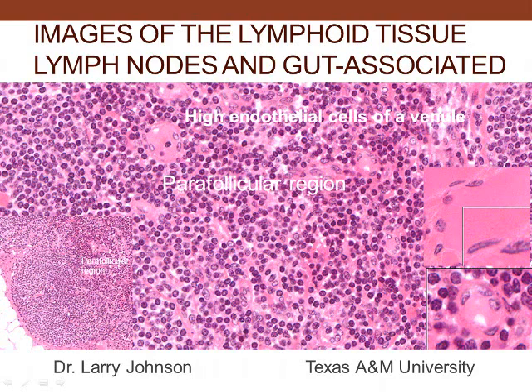Today we're going to talk about images of the lymphoidal tissue. We will talk about the different cells that are in the lymphoidal tissue, the architectural makeup of the different organs, and how it facilitates their function, either filtration or the production of lymphocytes, and that's what we'll be talking about today. Images of the lymphoidal tissue.